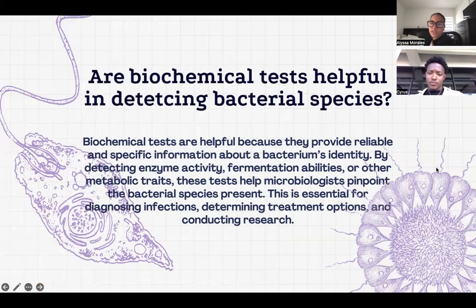Are biochemical tests helpful in detecting bacterial species? Given in our class, they were very helpful. We were able to run biochemical tests multiple times, just to reconfirm our answers. Most importantly, they provide reliable and specific information about the identity of a bacteria.